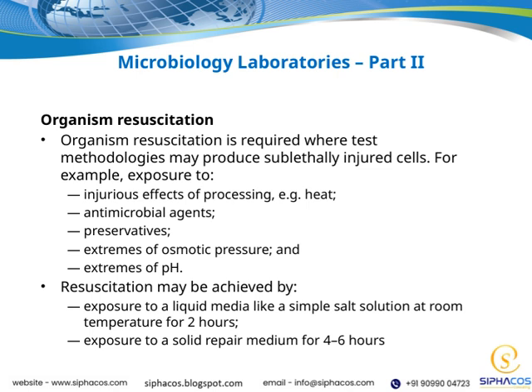Understanding and applying these resuscitation techniques is crucial in microbiology testing because it ensures we are not underestimating the number of viable organisms present, especially after stress conditions. This step helps us get a more accurate picture of microbial contamination and safety.